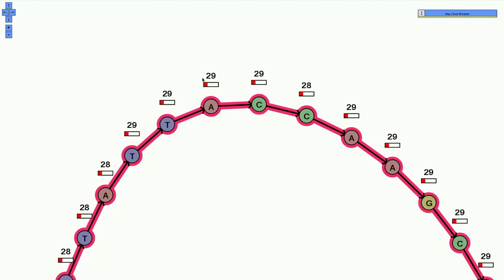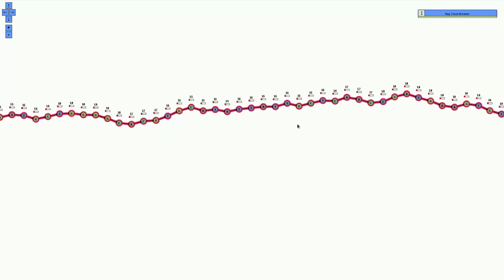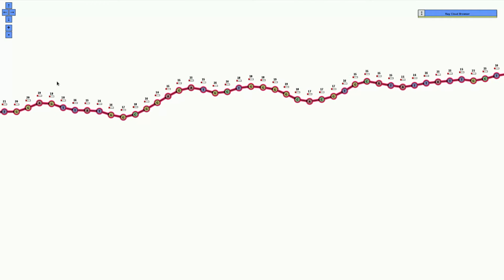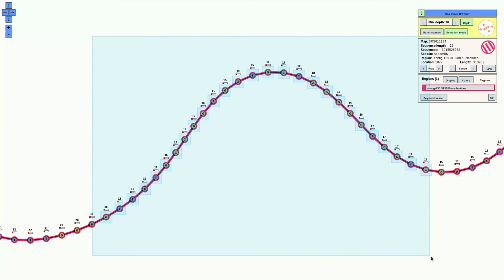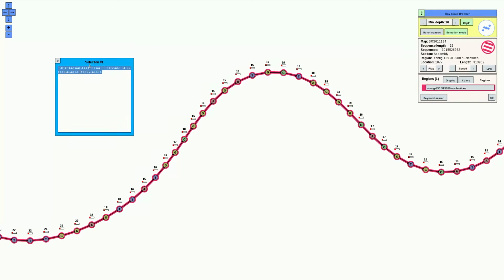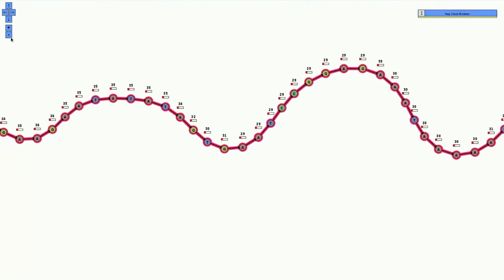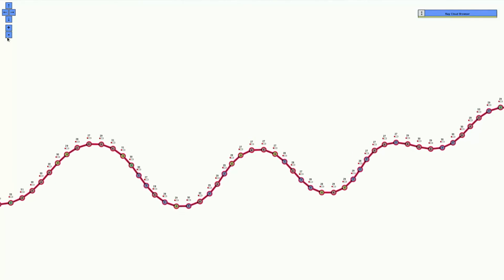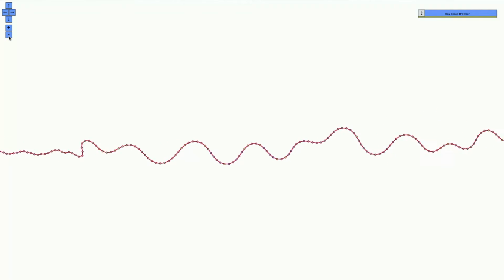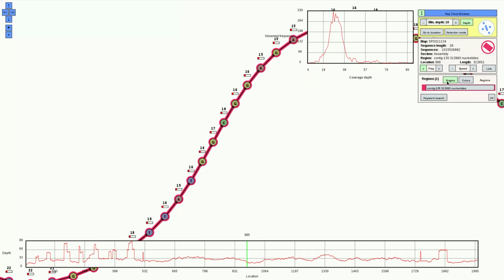What can I do with that viewer? I can explore huge DNA graphs using a web browser. That's cool, is it not? For example, I can select a part of this graph to inspect its DNA sequence. I can also zoom in and out and move around using the controls. What else can I do? For me, the main entertaining feature is to press the play button and let the thing transport me.